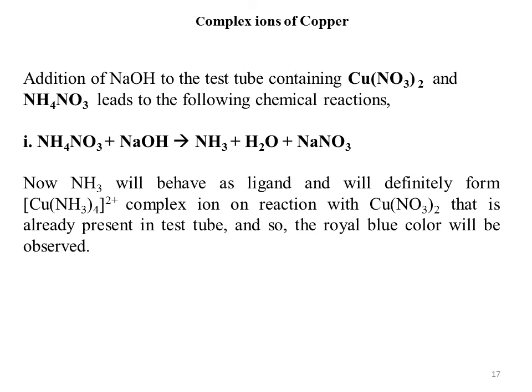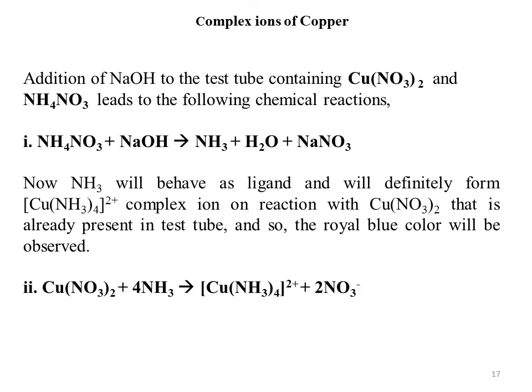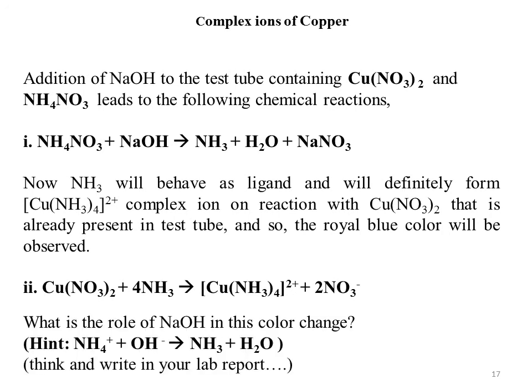So you can see in the next equation copper nitrate reacting with ammonia and producing the royal blue colored complex. Here you have to report what is the role of sodium hydroxide in this color change. So think about that and write in your lab report. Thank you.